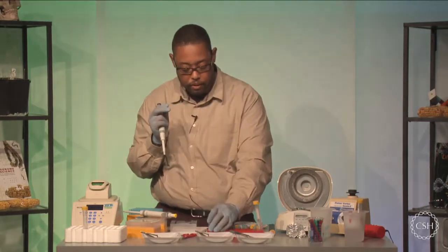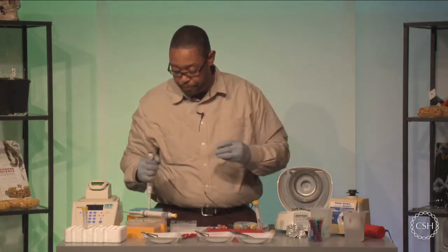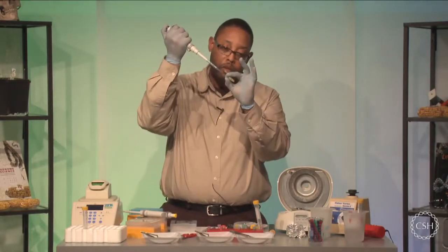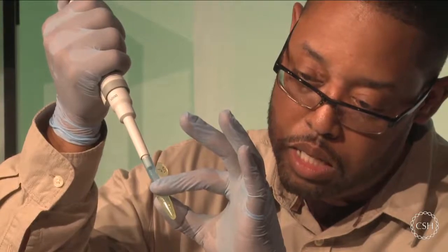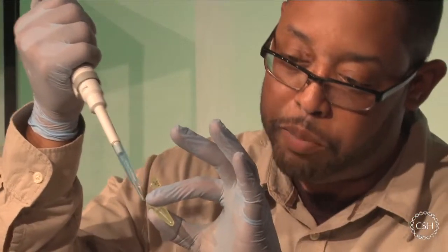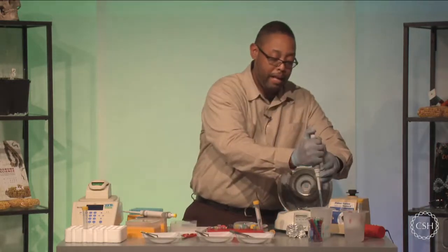And then I'll place this here, and we'll do the same for the other two test tubes that we're physically working with. Please be sure to make sure that you're changing tips each time, because we don't want to introduce any contamination, and this is a crucial step at this point.